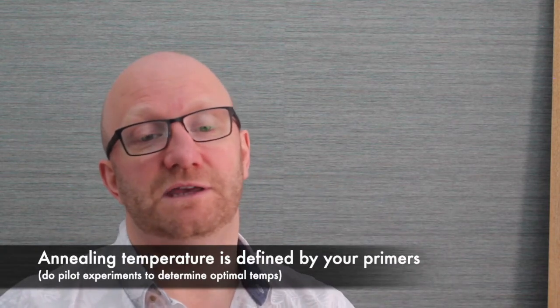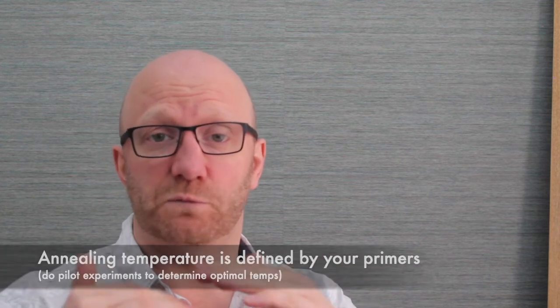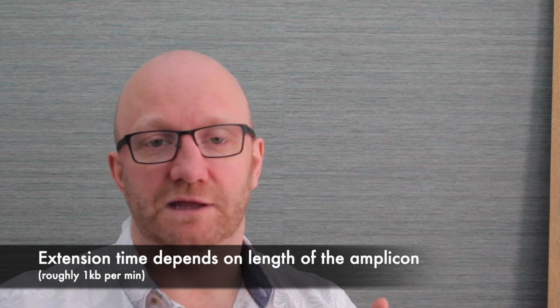You might do this for longer if you're using a long target or have high GC content. Then you drop the temperature to the annealing temperature and you keep it there for about 30 seconds. This allows your primers to bind to their target. And then you raise it to the working temperature of your enzyme, the extension temperature, usually 68 or 72 degrees, and you hold it there for a length of time that depends on the length of your transcript. So it's approximately 1 minute per kilobase of the target. At this point, the Taq does its job, it extends from the primers.